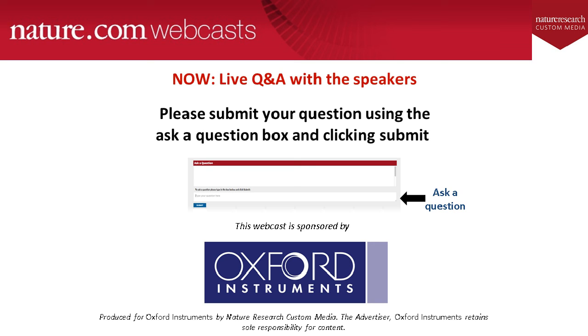So with the work that we've done, I try to work at fairly high currents to maximise the X-ray signal, but sometimes you can't. It depends also on the resin that you're using. Some resins are more reactive than others, so you have to adjust the kV, the dose, and your scan times as well to find the optimal settings for your sample.